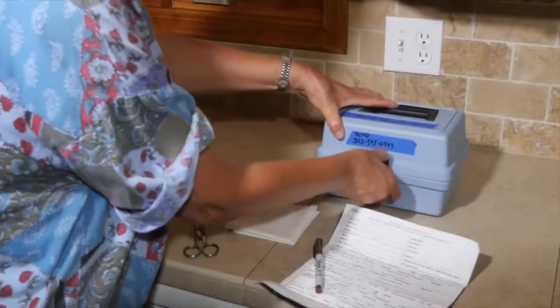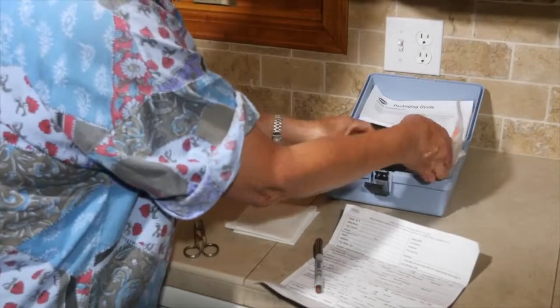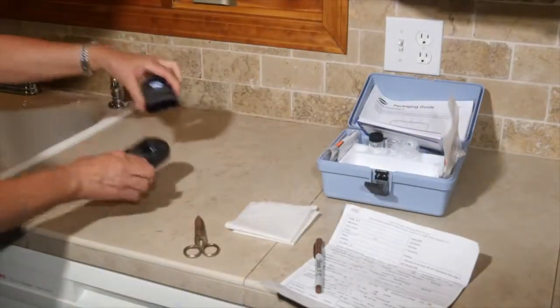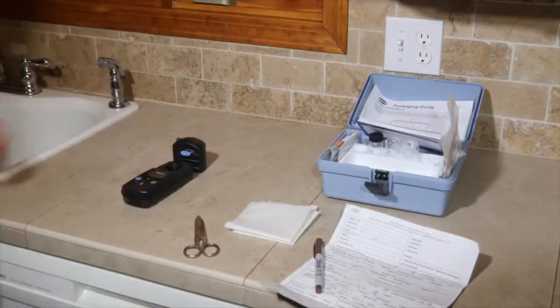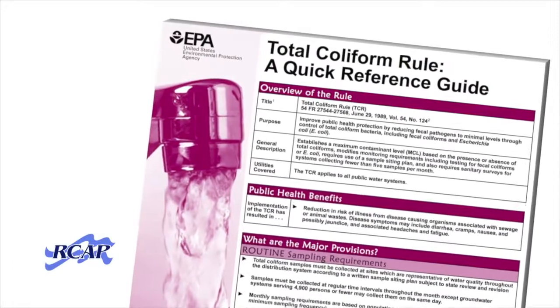There are a number of methods that can be used for chlorine measurement. Make sure that the method you use has been approved by your primacy agency. Colorimetry using a handheld spectrophotometer is most common, but there are also a number of other EPA-approved methods. Ensure that the methods you use are approved by your primacy agency.